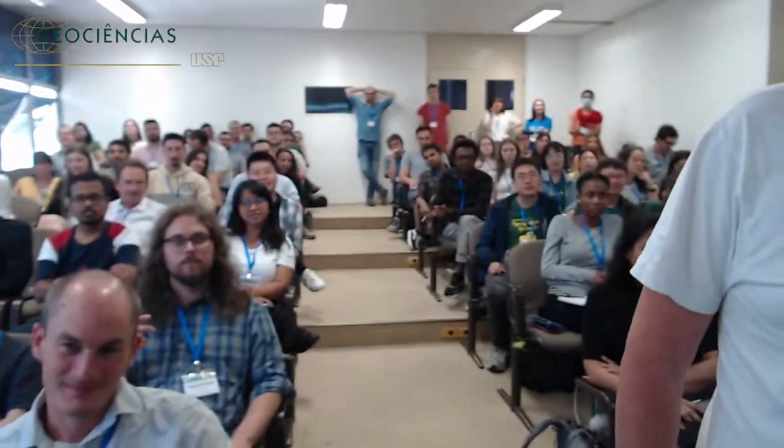Hi, Hubert Vonhoff from Mainz. I have to do with dating, but I don't do the dating myself. But we have projects lately in which we use both, and this perhaps is a question to all the uranium-thorium people, in which we use both laser ablation and solution-based dating. I know the basics of this. With laser ablation, we have less sensitivity, so we have not so good errors and things like that. But we can do a lot more. I was trying to provoke perhaps a little bit of a discussion here about where we think the field is going. Are we moving towards laser, and simply by being able to shoot so many more holes, get better statistics, get good dating? Or is there a limit to this, that we really always need solution-based?